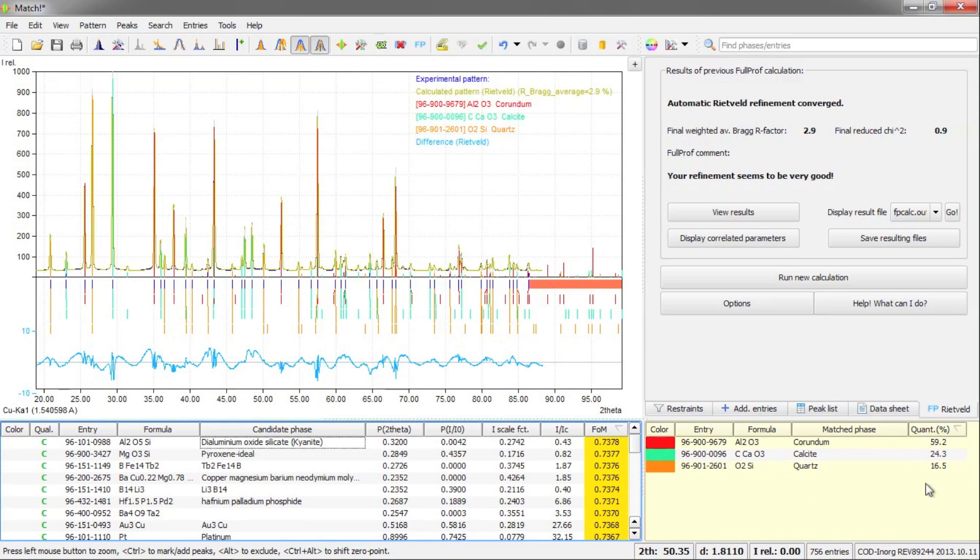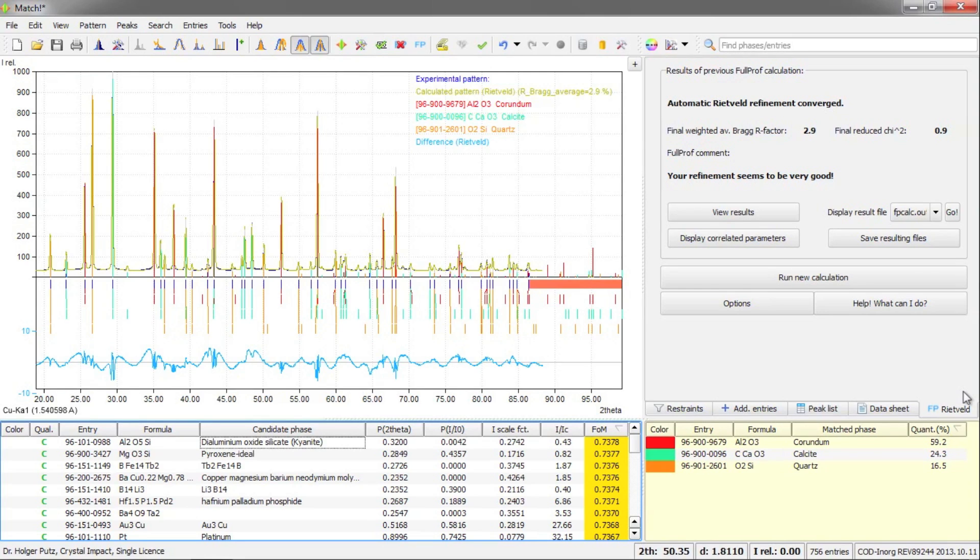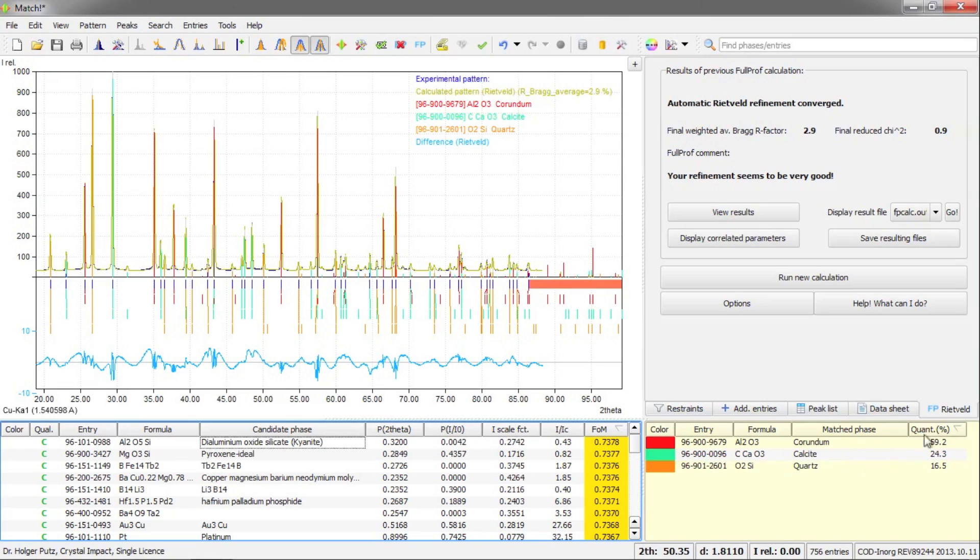Here in this column, you can see that the values have changed a little bit. So these are now the values resulting from the quantitative analysis using the FullProf software. I guess we are done now. We have found three phases in our sample as well as calculated the corresponding quantities from the diffraction pattern.